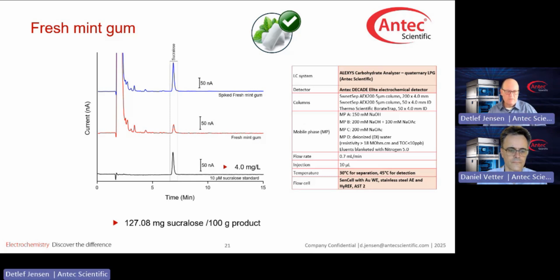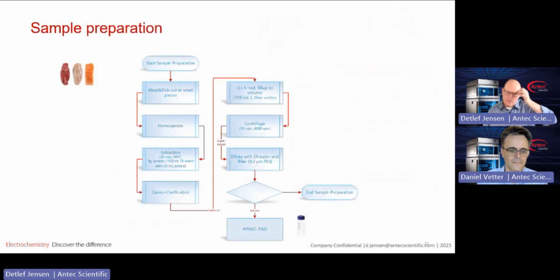Now, sucralose in mint gum, and I'm not sure whether you ever had the pleasure of analyzing whatever in chewing gum. One thing is for sure, that is a very sticky analysis. So it's no fun to really analyze carbohydrates and artificial sweeteners, for example, in chewing gum.